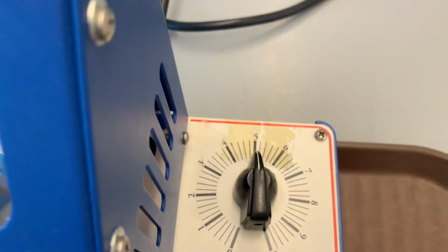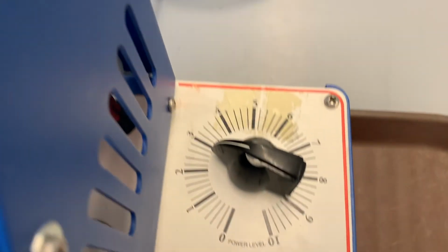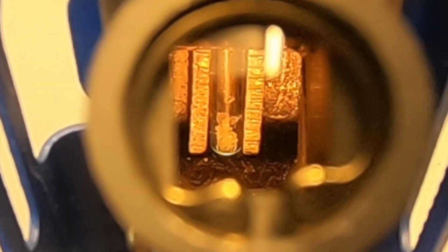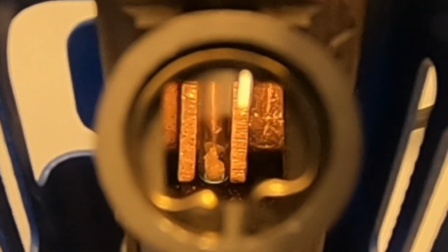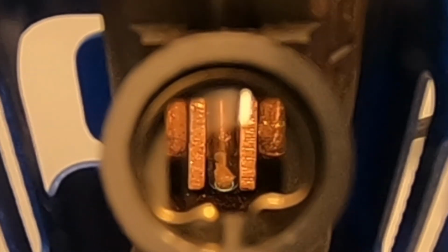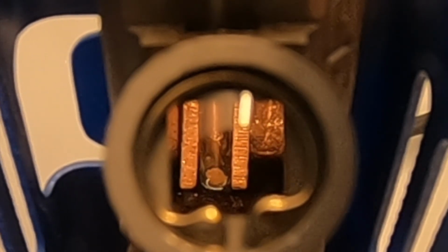Once we are within 20 degrees of our expected melting point, we should turn the dial down and take it very slow. Somewhere around 3 is a good spot. Throughout this entire process, we should be looking through the eyepiece for signs of melting. When the first crystals start to melt, record the temperature. Then keep watching and record the temperature again when the last crystal just disappears. This will tell you your melting point.